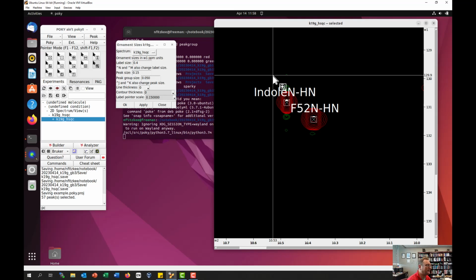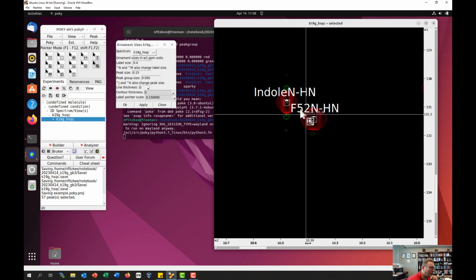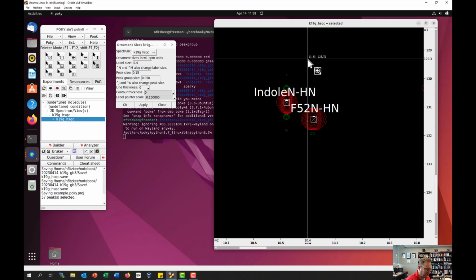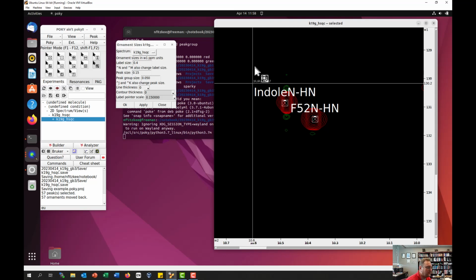But because you're not looking at individual peaks, you often make mistakes in over-centering your peaks. You might have a peak that you know is actually two peaks, and it'll cause those to collapse onto one. So what I typically like to do, I type EU to undo, edit undo.